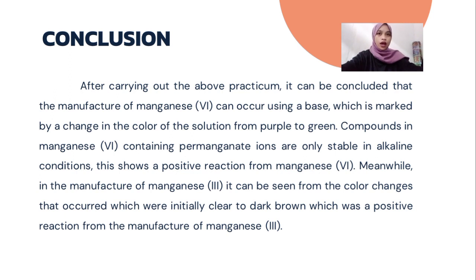Meanwhile, in the manufacture of manganese 3, it can be seen from the color change that occurred, which went from clear to dark brown, which was a positive reaction from the manufacture of manganese 3.